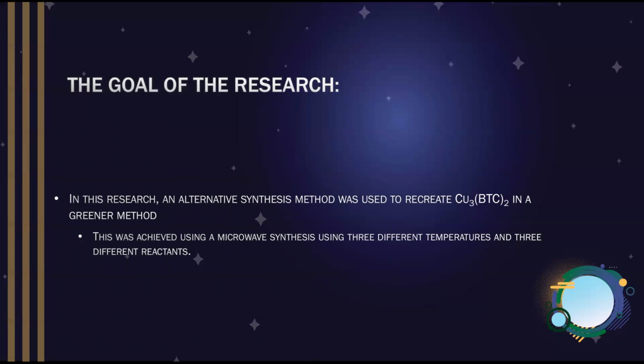In this research, an alternative synthesis method was used to create copper BTC in a greener method. This was achieved using a microwave synthesis using 3 different temperatures and 3 different reactants. This is then compared against the solvothermal method, which takes place over an 8 to 16-hour period and requires significantly more solvent.